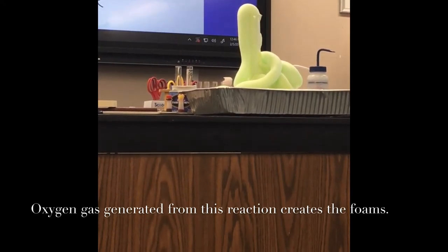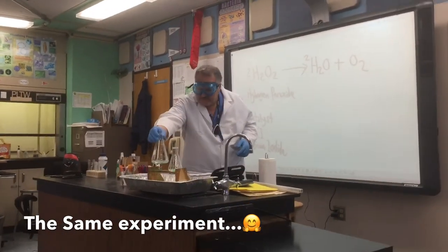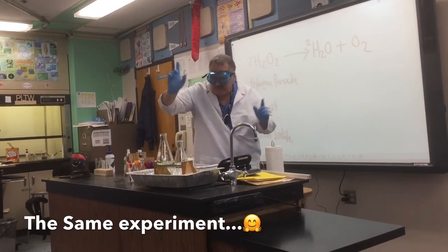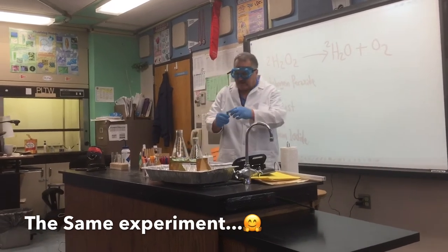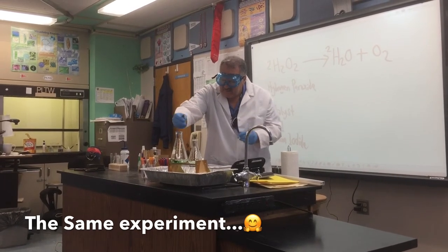Again, it is very hot. I already told you. And did you notice something? I added what? Soap, hydrogen peroxide. What's the percentage of hydrogen peroxide? 30%. And thank you for telling me safety comes first. I'm going to add some colors here. Here I'm going to add some green. That's the school color.